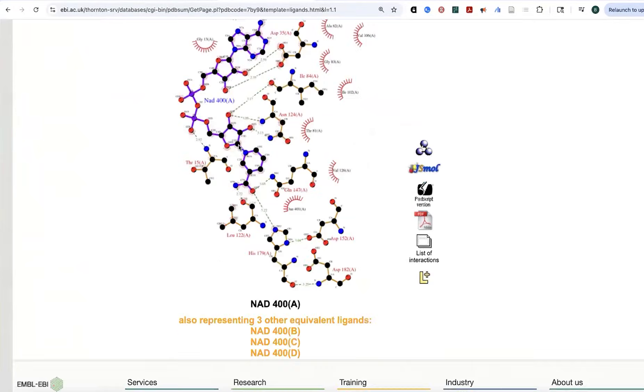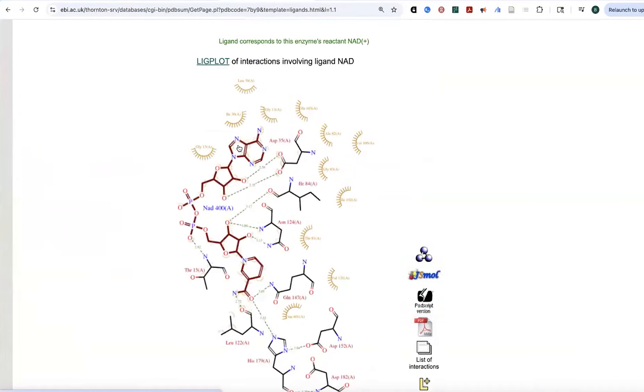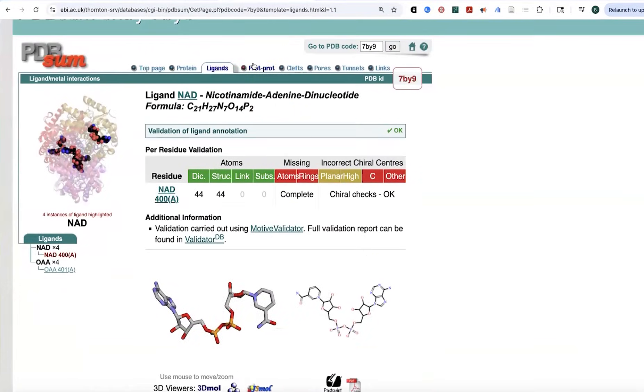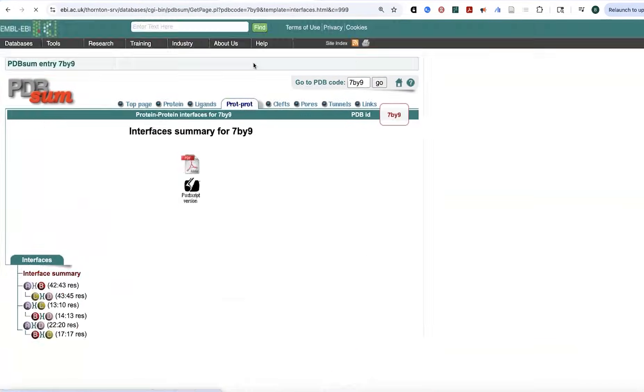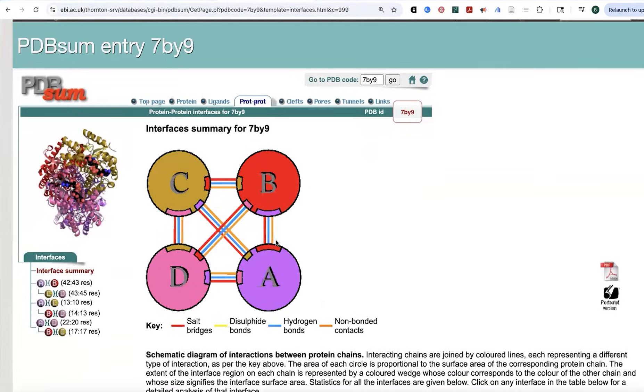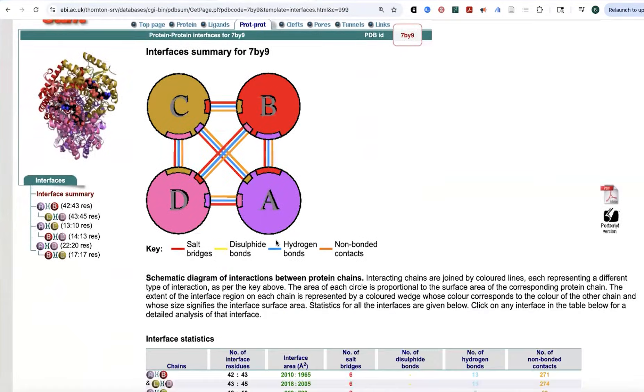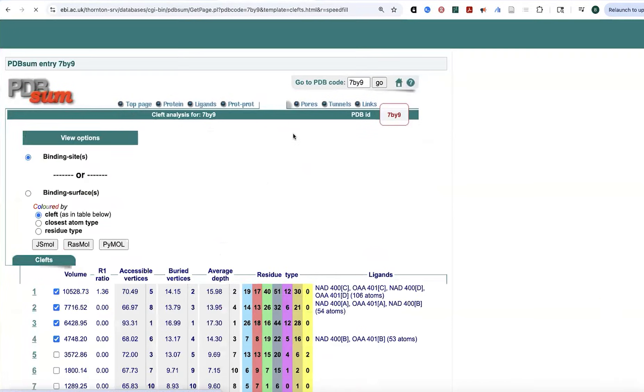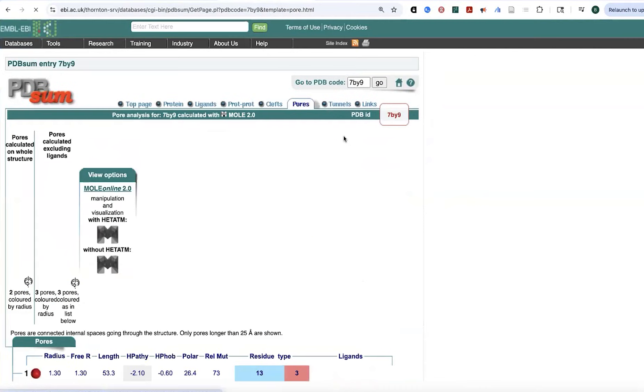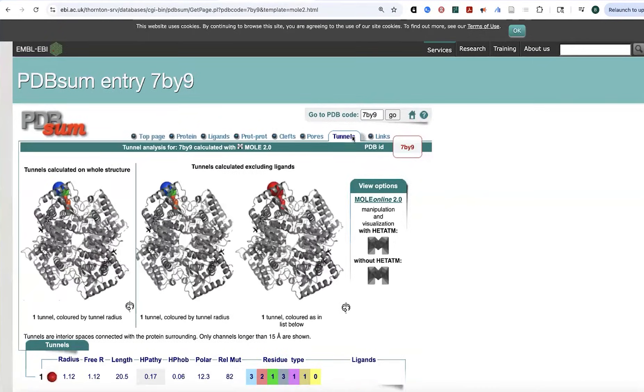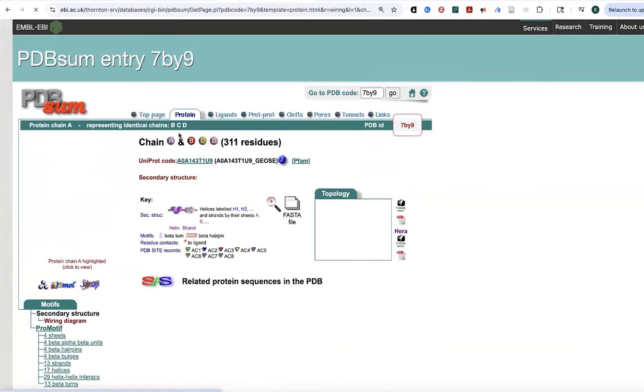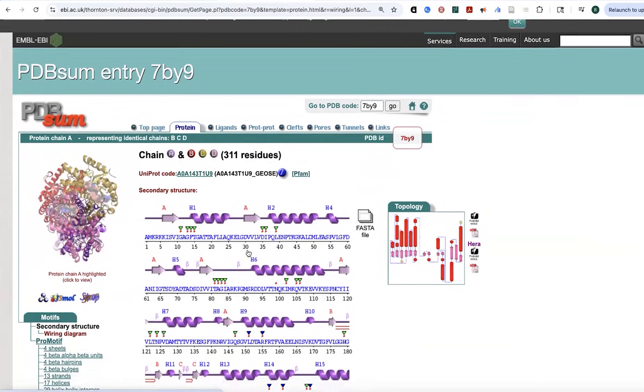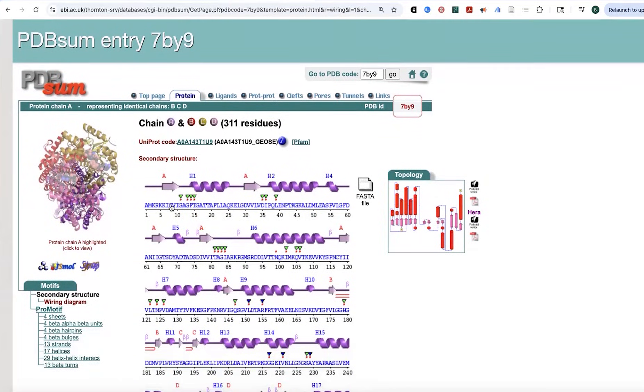And what it'll do is it'll show you all the interactions with ligands. It'll show you the interactions between different subunits of the protein. It will show you where there are clefts and pores and tunnels. And it will show you various map types to show you the secondary structure, as well as any domains and annotations and bonds and things.